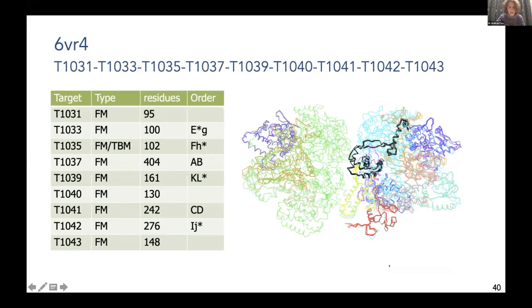And I can get halfway there. So what's here, the A, B, C, D, F, G, that's the order that they went in. If they're lowercase, they were put in by symmetry, manually putting them in as symmetry copies as part of the pair rather than actually by molecular replacement search. And star means that I did a REFMAC refinement between the end of that and searching for the next component, and so on. It might be possible to get more out of there.